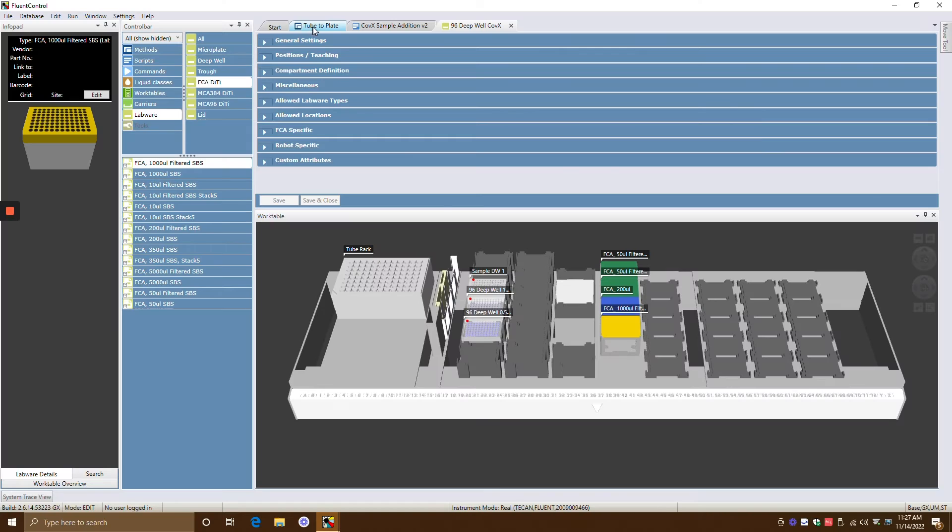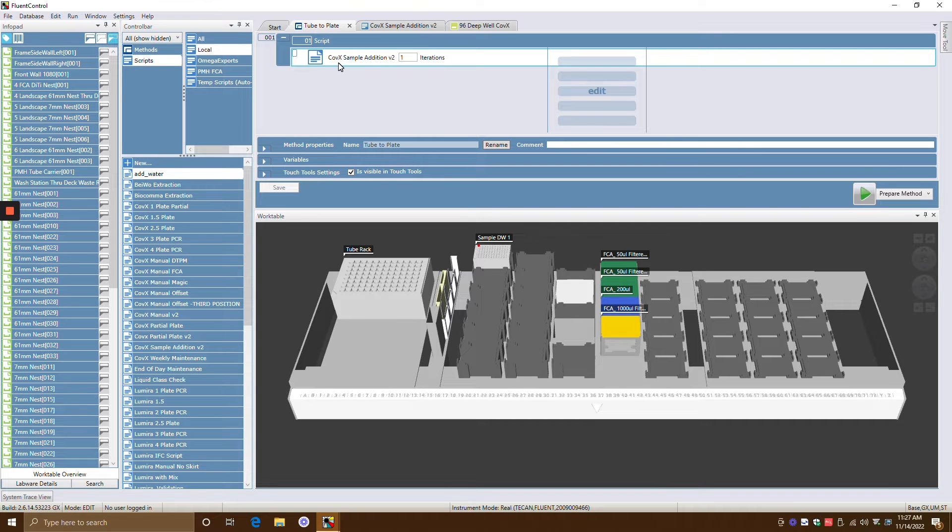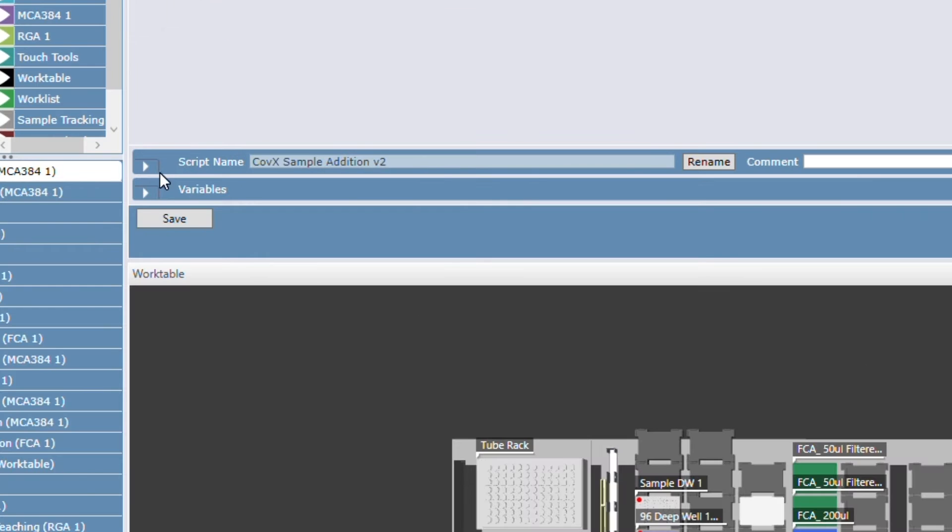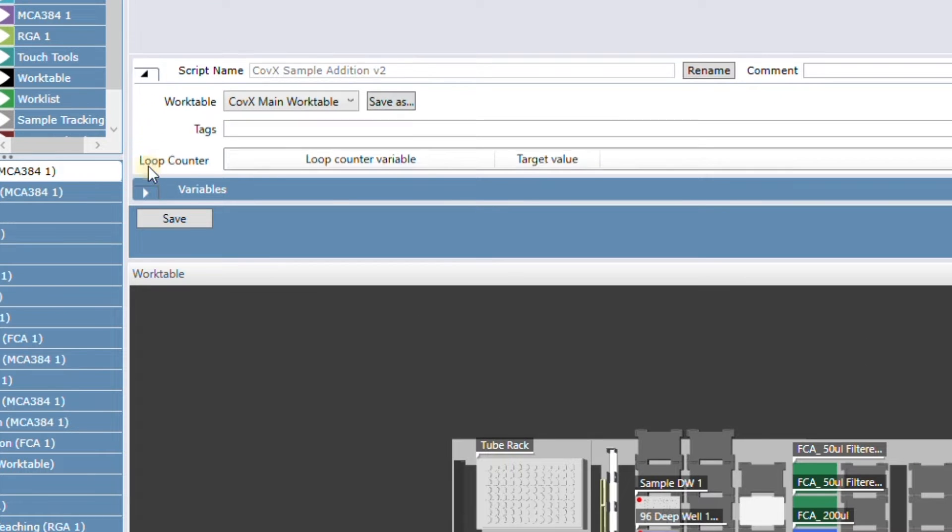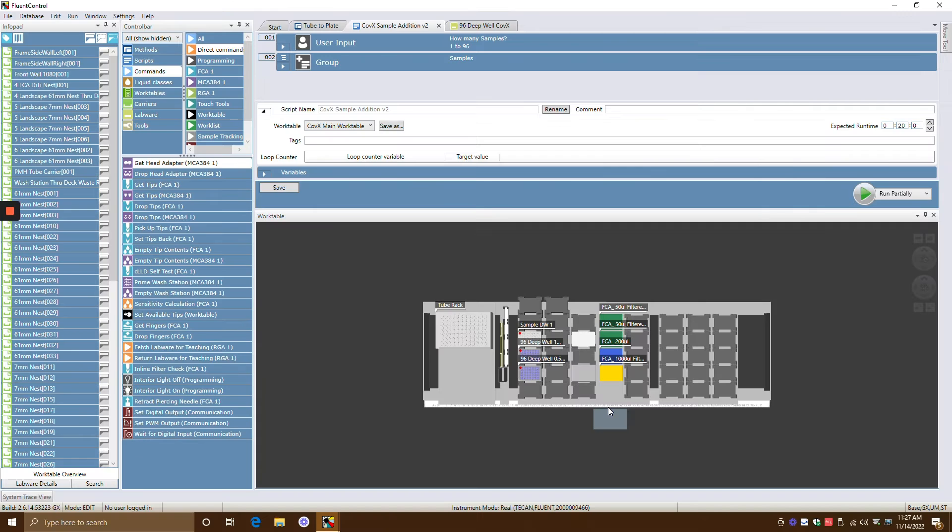Let's get into work tables. Say for example, here's a method that I have. Where you find where the work table is not here in the script, but more in the method. So here's the method. And if you look under script name, if you click this little arrow, that's where the work table is hiding. So you can change the work table from there and save it.